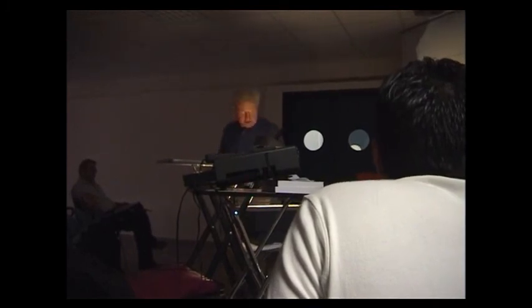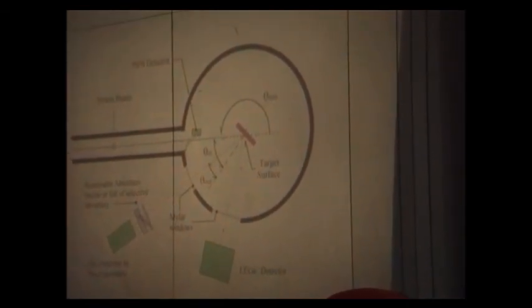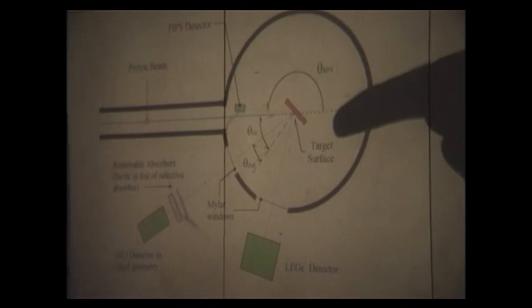Generally, it is possible to arrange the experimental setup in order to collect particles which are scattered by the sample. Not easy, but it is possible to make a quantitative analysis of an unknown sample by comparison. With the 10 micron hole here, we can reach a 1 micron spot on the sample.